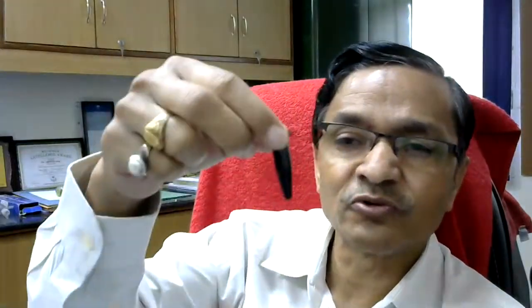For keeping them away from light, you don't need to use this one. If you are using this one, light will go inside and they will react with light, or some reaction will occur. If you keep them inside this, there is no entry of light, so light sensitive reactions can or should be made using this type of Eppendorf tubes. There are certain reagents which are sensitive to light.